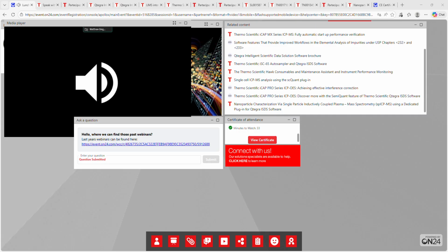Sometimes, if we have a particularly wide range, we can get heavier weighting towards the top end, and we see a lot of inaccuracy at the bottom end. In these situations, maybe 1 over concentration or 1 over concentration squared will give us better accuracy at the bottom end. That would be my two things: linear where you can, but if the range is wide, then maybe consider 1 over concentration.